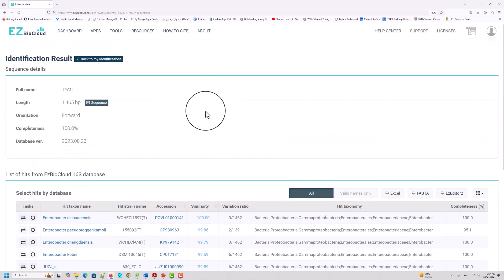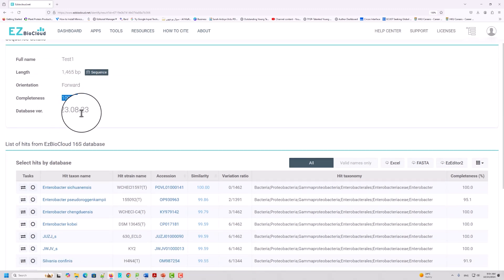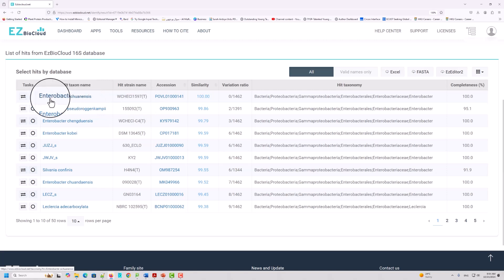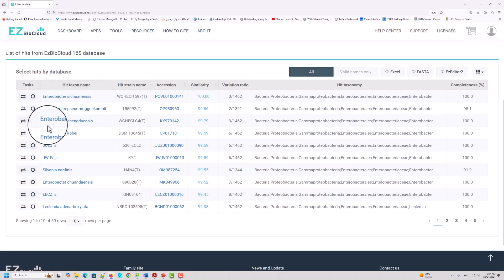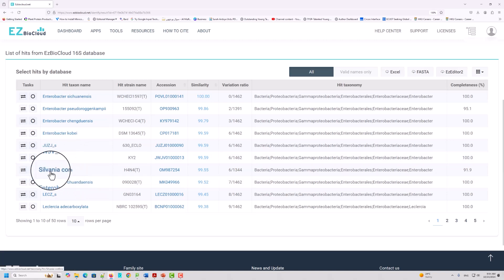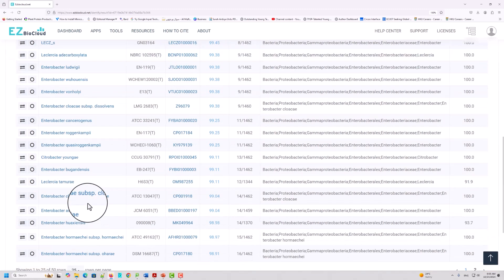When you click the plus sign, it gives you more data about your alignment and comparison — what the nearest species of your bacteria is. You can check the result: this is the full name of my sequence, which is 1465 base pairs, forward orientation, and completeness is 100%. This shows the database version being used. My bacteria is related to this first result, the second, the third, and the fourth. If you click the type strain name, you can get more information about that bacterial species. By default, it shows only 10 sequences, but you can increase the number here.